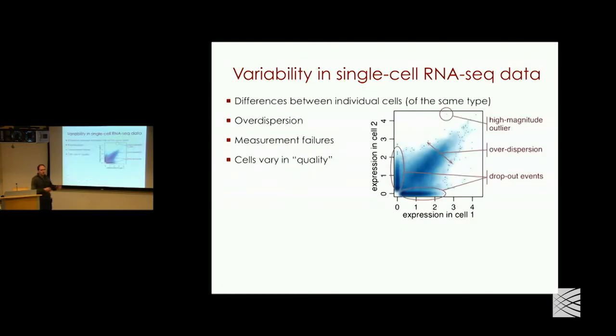All right, so I'll jump back a little bit and talk about some of the work we've done previously just to set the background, and then I'll talk about how we're basically moving that forward. So, one thing I want to emphasize, now this is an old picture, but just the specifics of the single cell measurements, the types of distortions you tend to get there.